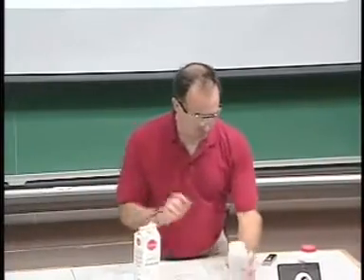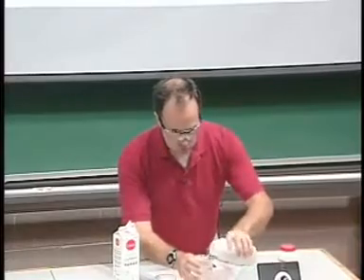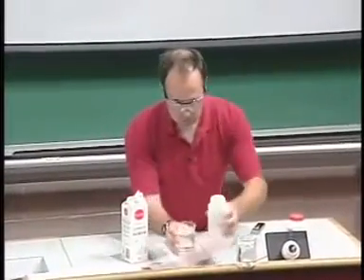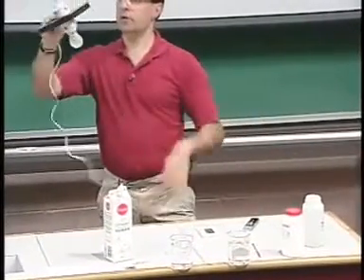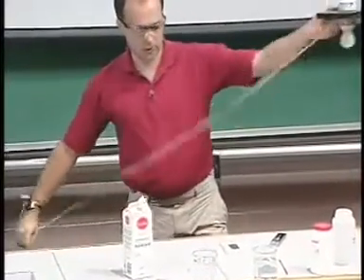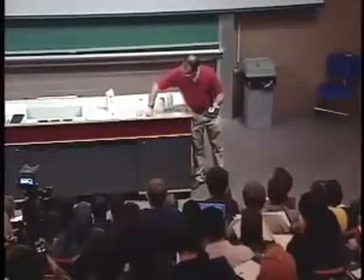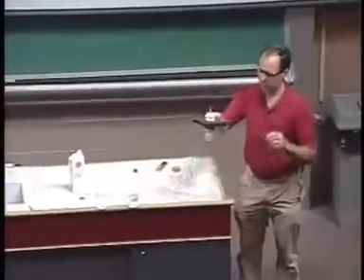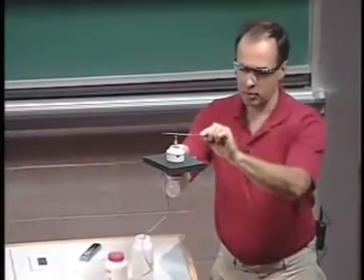So what I have here is just some water. I'll put that there, and more water. Then I have this awesome testing machine, which is lethal in the wrong hands. I'll plug this in here. And there is a light bulb on the bottom, as you can see, which will be on the top in a minute. And there's a couple of electrodes sticking out the top. And if something connects the electrodes, the light bulb lights, okay?